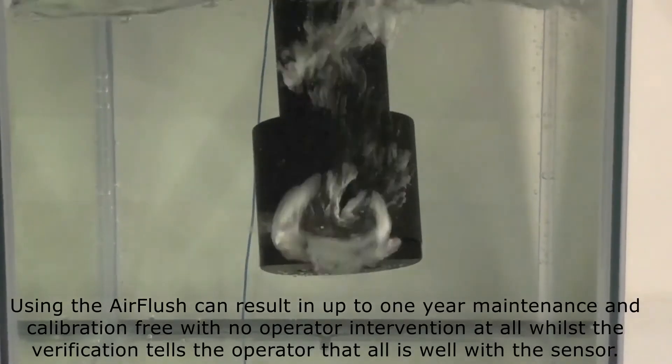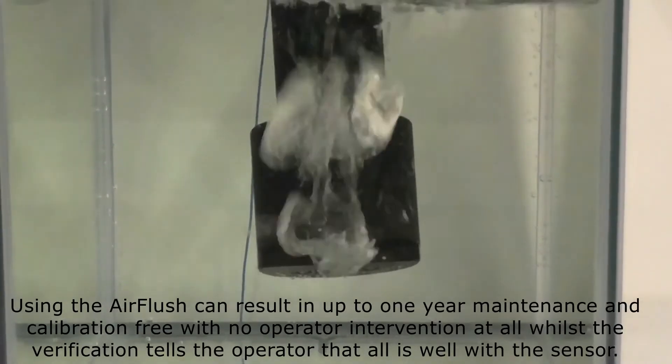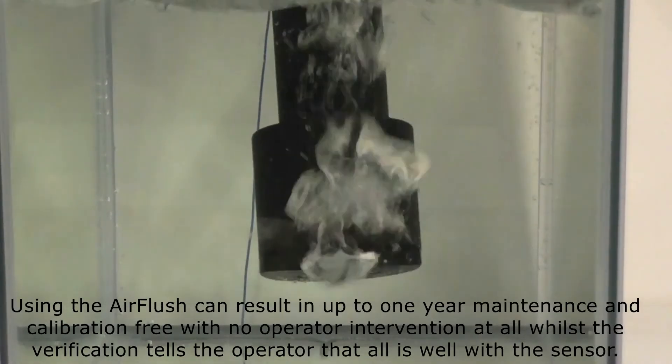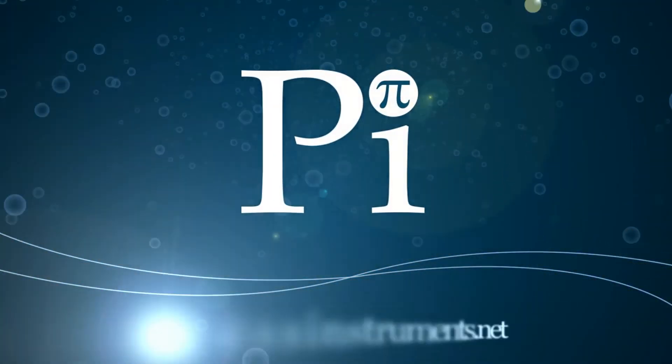Using the air flush can result in up to one year of maintenance and calibration-free operation with no operator intervention at all, whilst the verification tells the operator that all is well with the sensor.